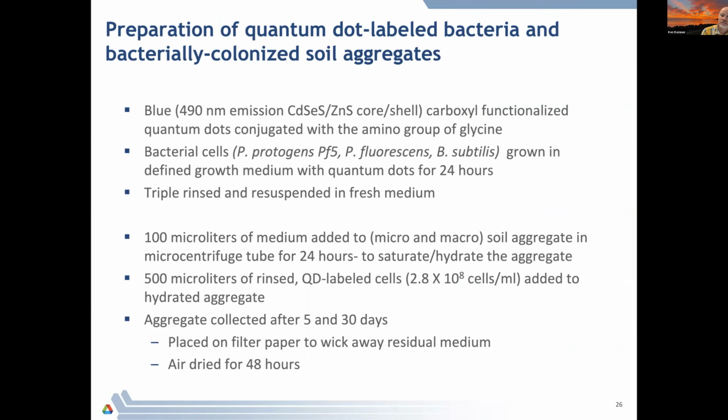So this is just a lot of words to describe what we did to prepare these cells. Top 3 bullets are just showing how we got the bacteria to take up the quantum dots, rinse them, get all this stuff that's not inside the cell, get them off, clean them up. And then we wanted to see if we could see the bacterial cells colonizing soil aggregates. And so we wetted one of these soil aggregates for 24 hours to get the water to move into all the pore space. After that, we put in a small 500 microliters of a solution containing these quantum dot labeled cells.